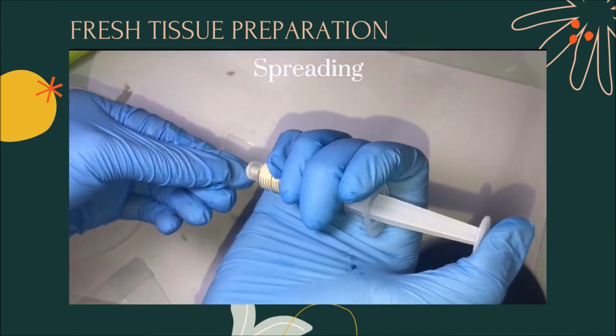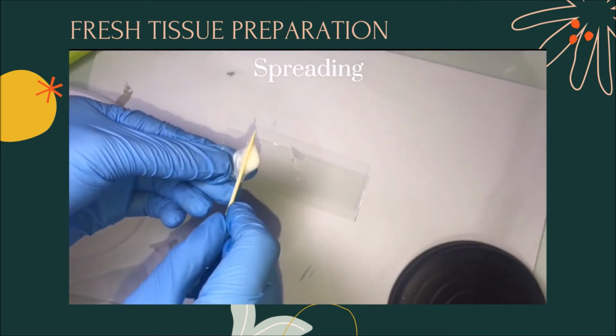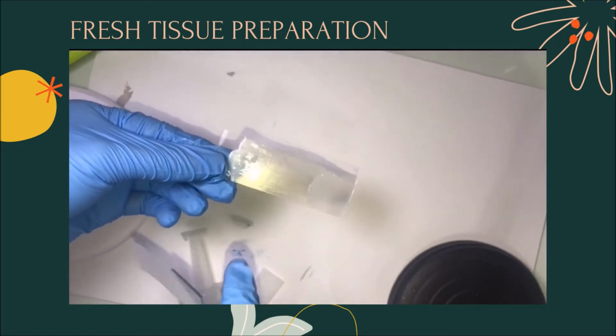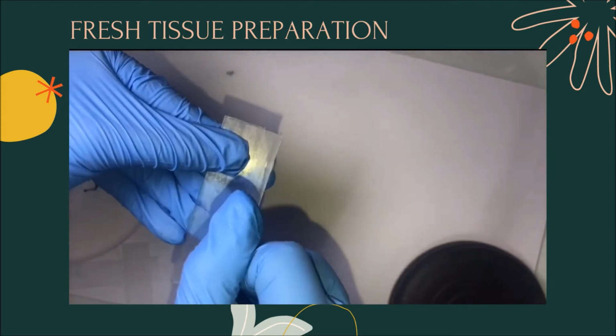For spreading, transfer a small amount of sediments on one end of a clean glass slide, and using an applicator stick, spread the sediments throughout the slide and cover it with a glass slide. Then, label your slide with your name, group number, and section.